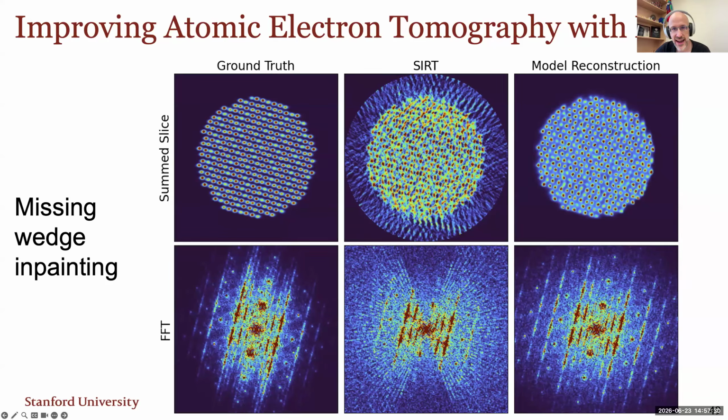Okay, Shantanu asks, currently MEP, multi-slice electron ptychography, is the most efficient method to reconstruct 3D information from a sample along a single orientation. However, papers record large dwell times, limiting its application to beam-sensitive materials. So I think that this is not really true anymore. So what he's asking is, is the current limitation the detector speed, or are there some other limits?